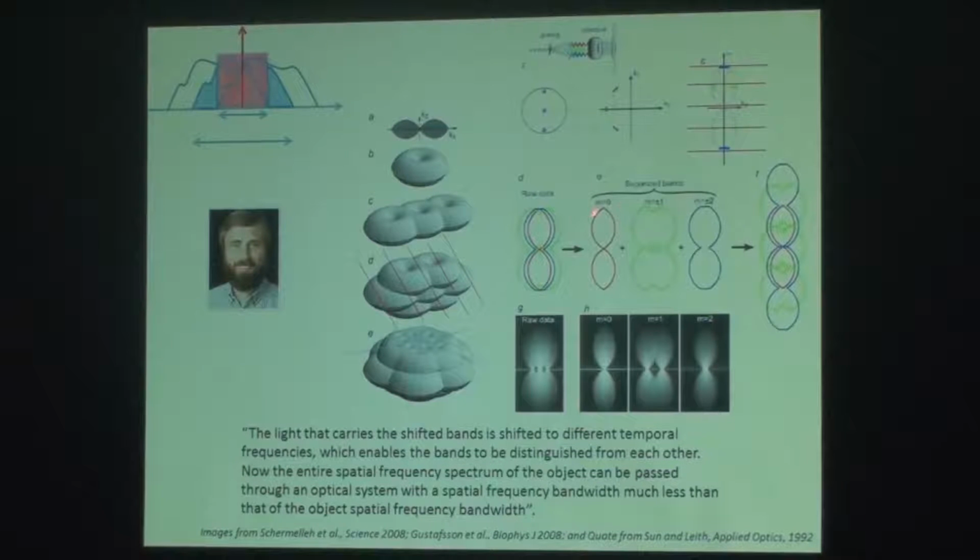Because you use reference information from the polarizers, you can put the 0, +1, and +2 light back into the actual frequency. Then you end up in this image. What you see is the 0 order in the center, which you normally collect with a normal microscope, and the blue and the green frequencies are the added frequencies collected.